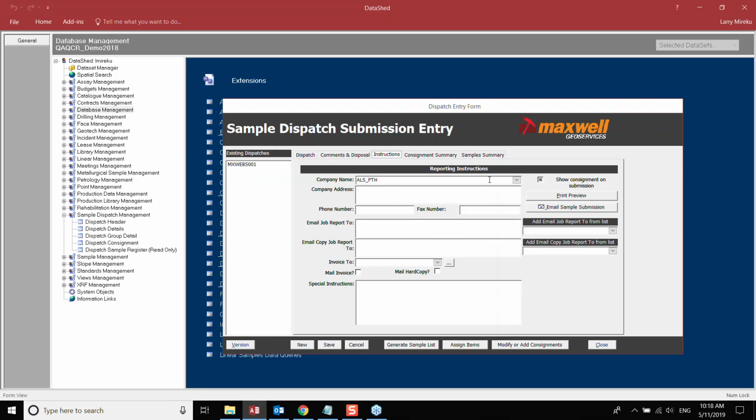Under instructions, you can put in a few more pieces of information here for the lab as well. Who is going to be receiving the report from the lab? I'm going to put my name there just so that if anything goes wrong, I'll be the one to be blamed. That's fine.